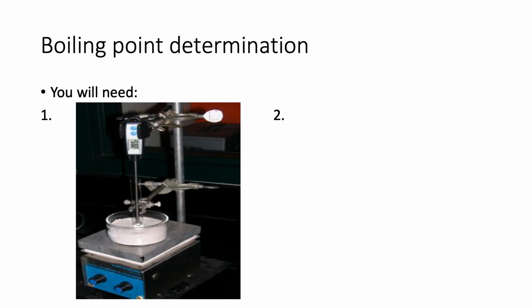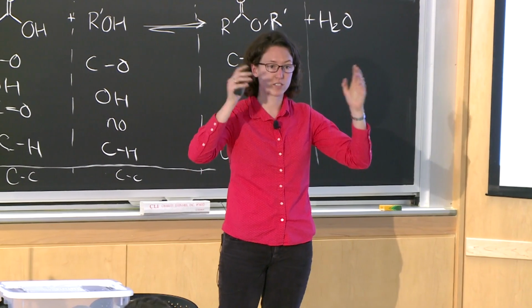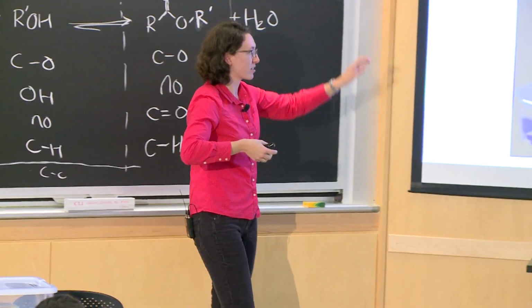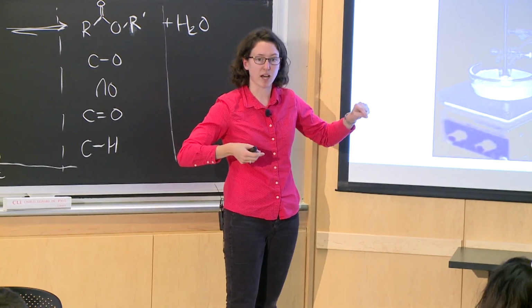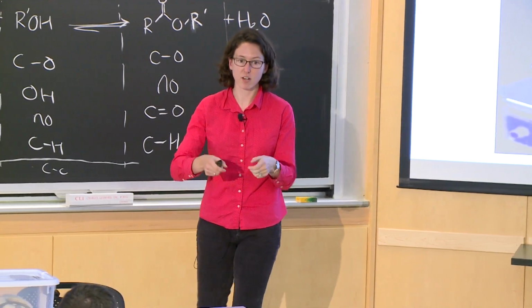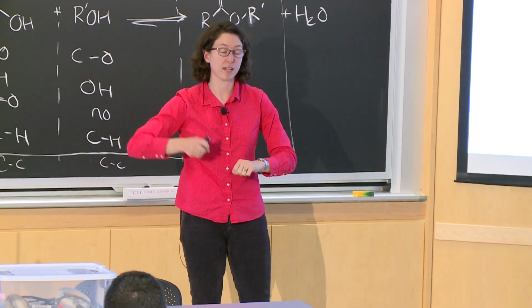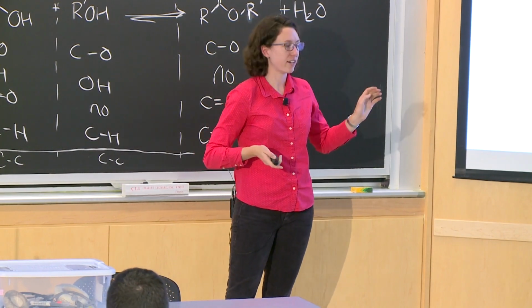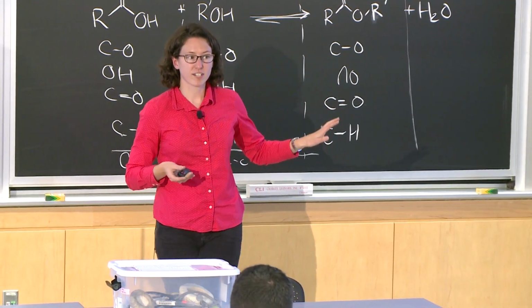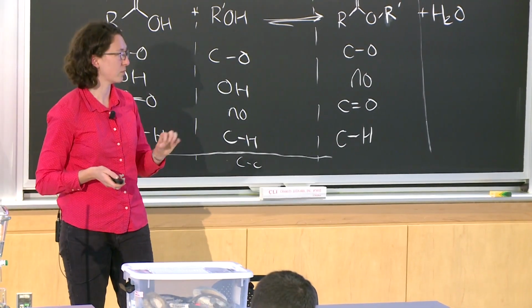And you want to wait. So the second thing that you'll need is a lot of patience. The temperature will go up very, very slowly as the vapor reaches the boiling point. If you've ever boiled water and you cook something, you know that you'll start to see steam and water vapor before the liquid itself is boiling. Same thing happens here. You'll start to see the drips, but then the temperature may still be going up. So this is one of those things that you don't want to sit there and watch because you will become very impatient and you'll say, oh good, the temperature hasn't changed in 30 seconds, this must be it. But then if you come back in 5 minutes, the temperature has indeed gone up and then you have the incorrect boiling point. So this is one of those things you can set up and then check on after a while. And once the temperature stops increasing, that will be your boiling point.